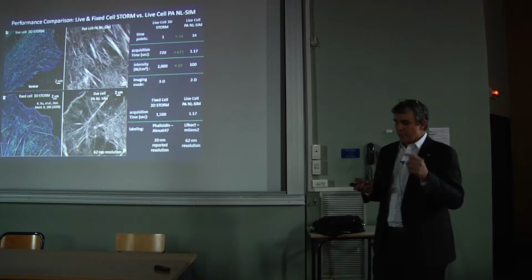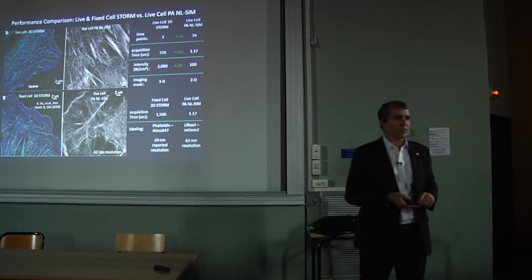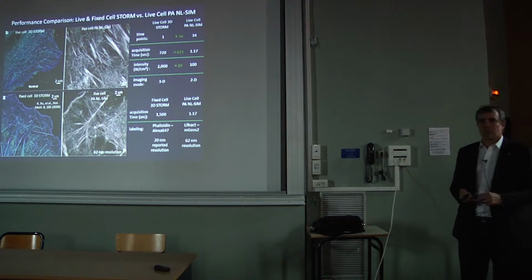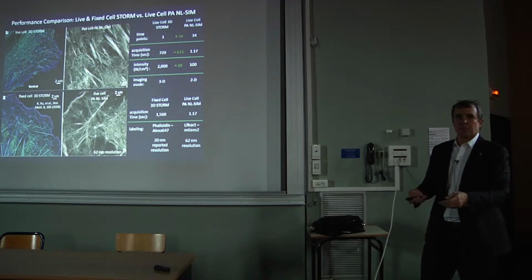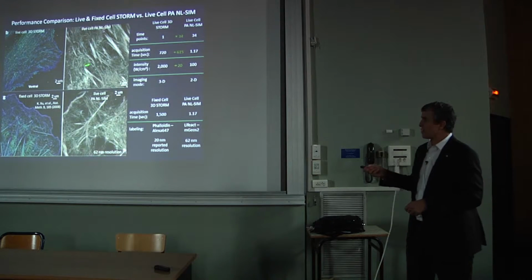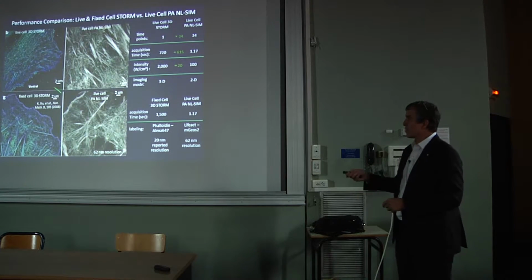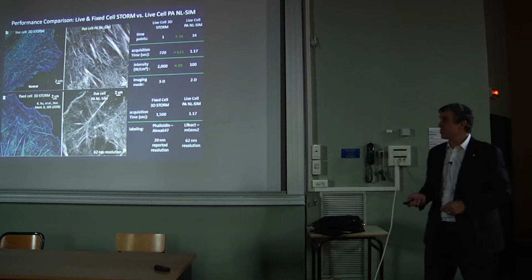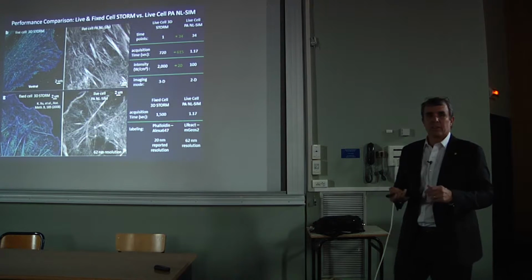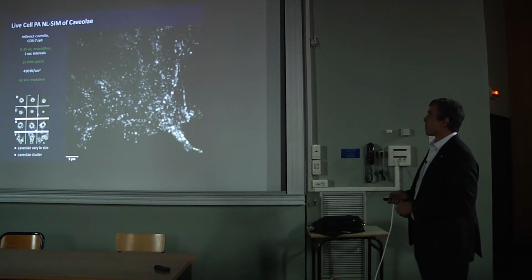specimen. So if the reason the Nobel Committee didn't give the Nobel in part to SIM was because it didn't have resolution good enough to really be in the same ballpark as STED, RESOLFT, and localization, this is to prove them wrong, and that's not the case. And that SIM can be every bit as good in resolution and vastly superior, orders of magnitude superior, in terms of intensity and speed of acquisition.